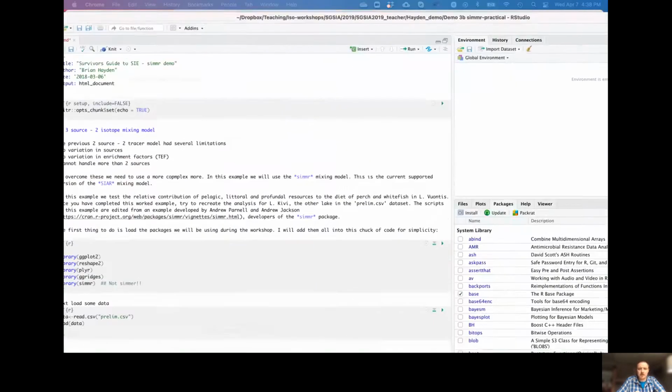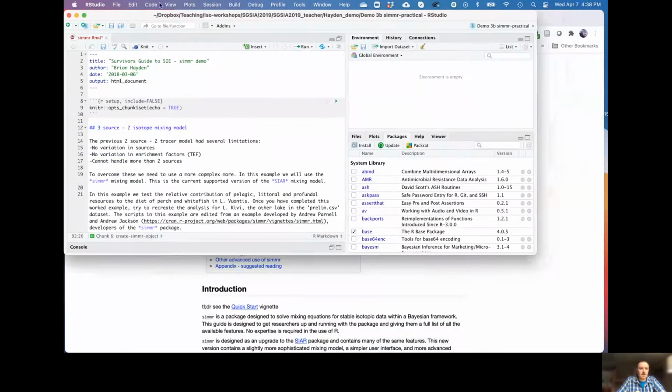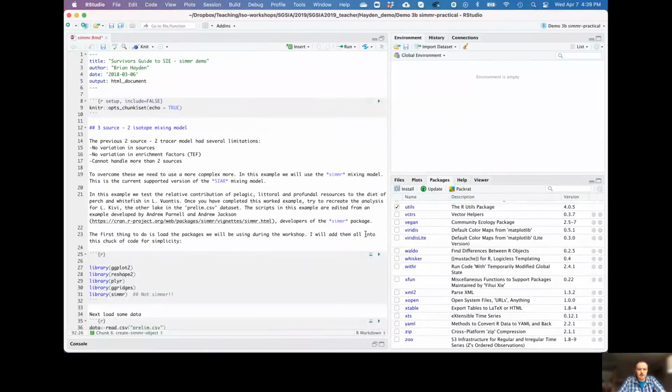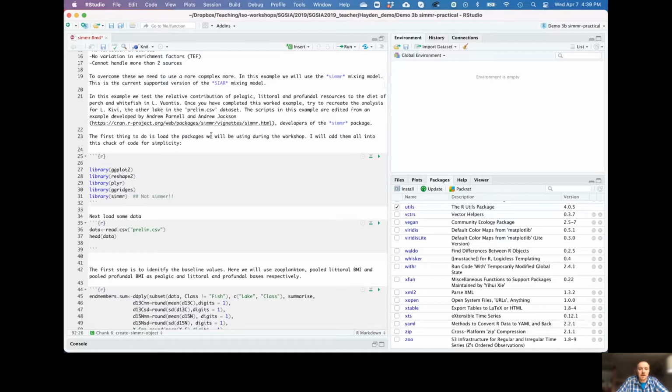Okay, so let's bring in our RStudio, and it should be looking familiar to all of you by now, hopefully. I'm just going to fit this to the size of my screen. We're not going to talk about the R Markdown and all that now, but essentially, as you remember from previous videos, we've got boxes of script where we actually run the code, and then annotated notes around it. And again, we've got a link in here to the website that I just referred to.